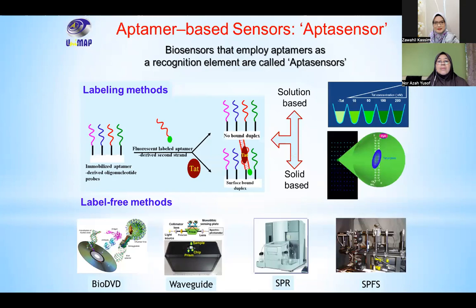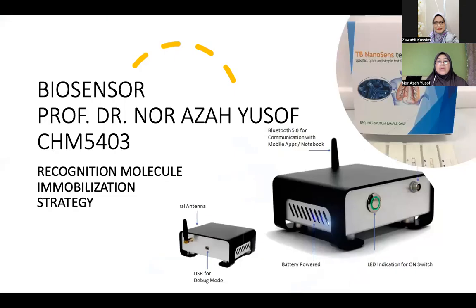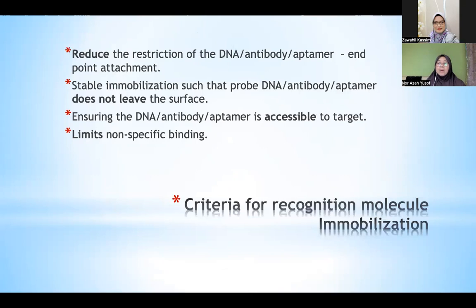So those require optimization, which means you have to do some study to look at how much is suitable to be immobilized on top of the sensor. The other one is that the immobilization has to be stable. We do not want the biomarker we attach to simply leach out and leave the surface whenever we are doing an experiment. So we don't want that to happen. We have to think about a good strategy.